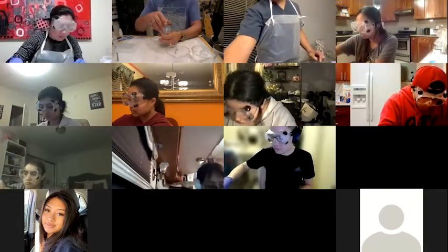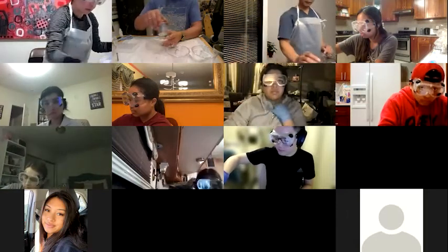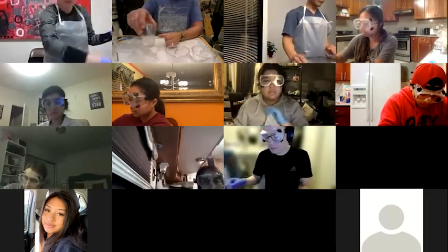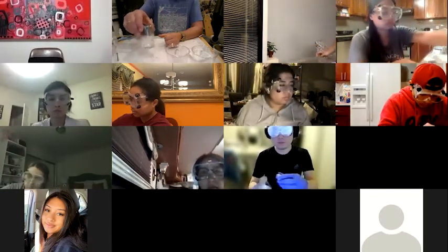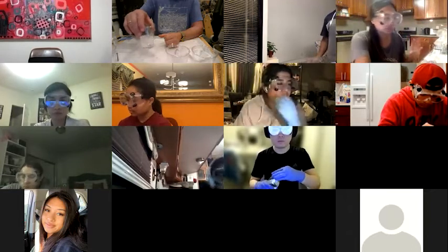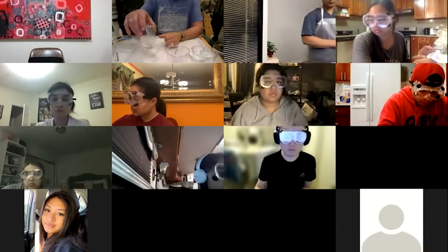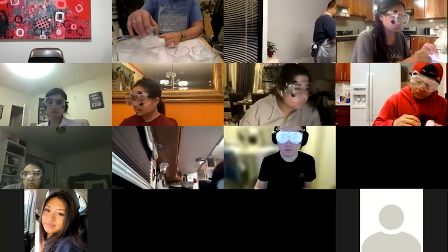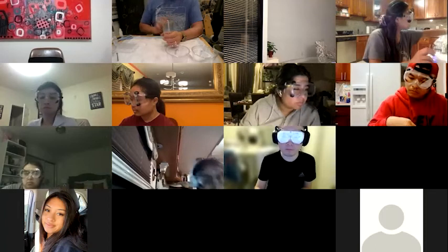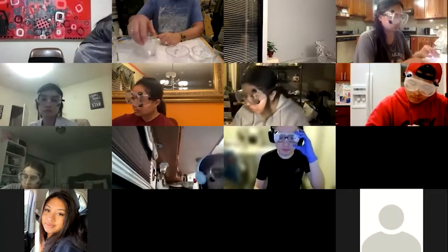Appears to be a little bit of an endothermic reaction. If you feel the cup, it's a little cold. So it is taking energy to get this stuff to go into solution. And it's taking the energy from the water. Oh yeah, it's definitely endothermic.